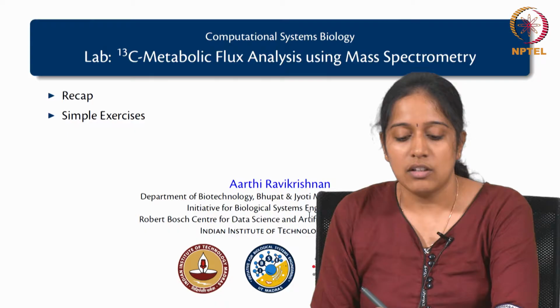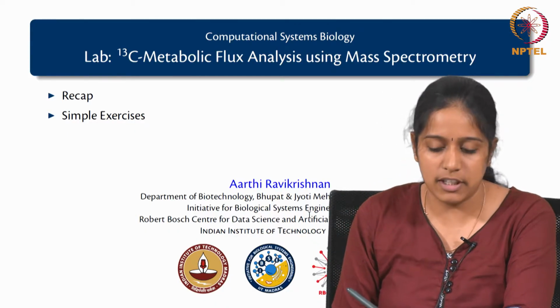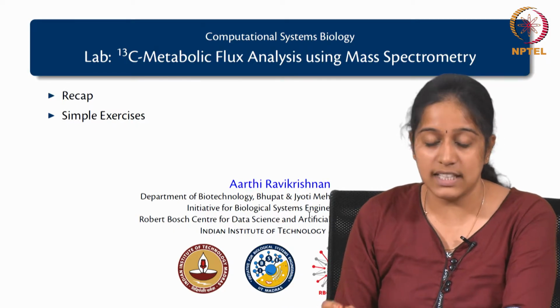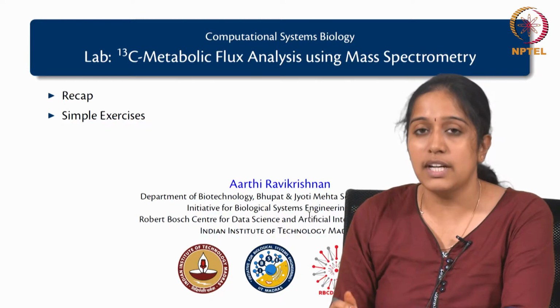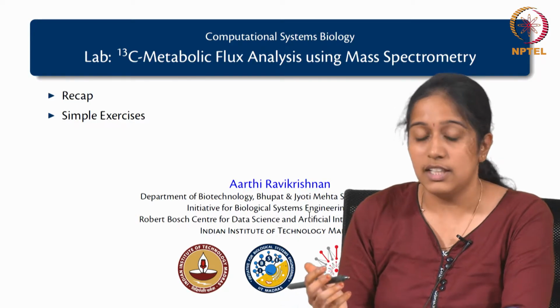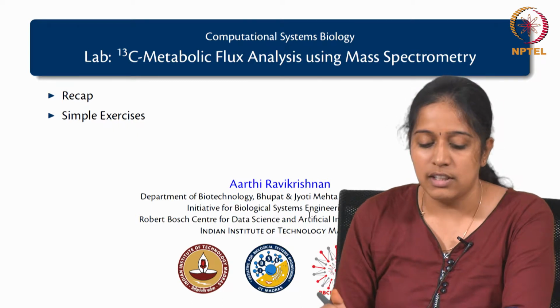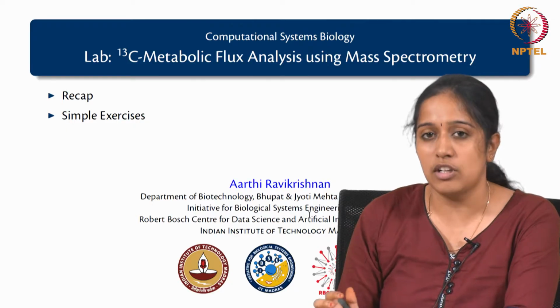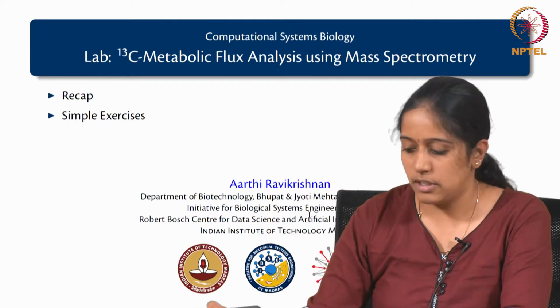Welcome to this session on C13 metabolic flux analysis using mass spectrometry. In this session we would be handling a few examples. So, this would be a lab session where you would get a flavor of the kind of data that is handled in metabolic flux analysis using mass spectrometry, and also have a few ideas on what kind of problems can be solved using C13 MFA using mass spectrometry.